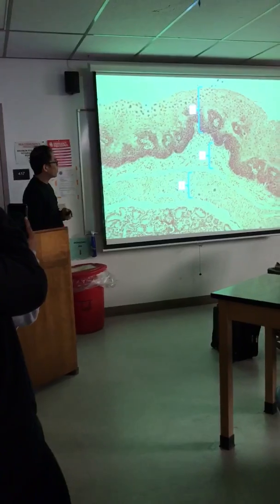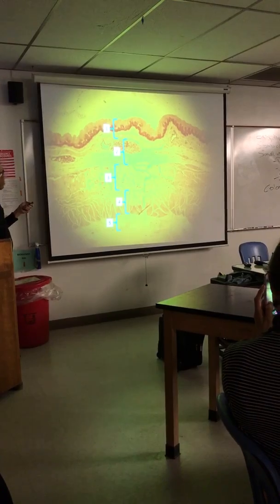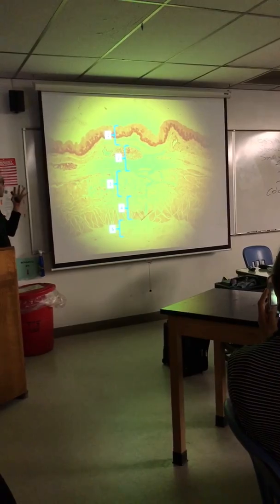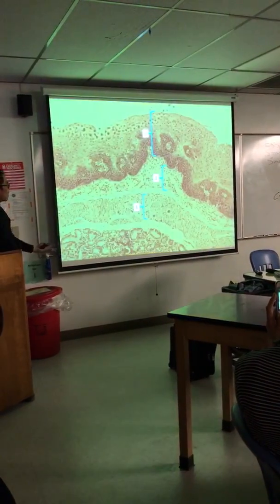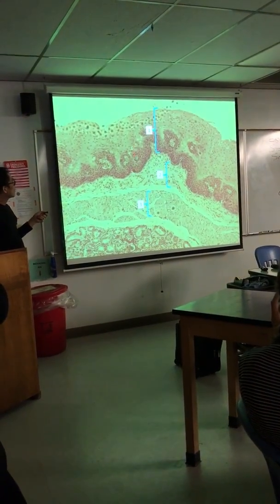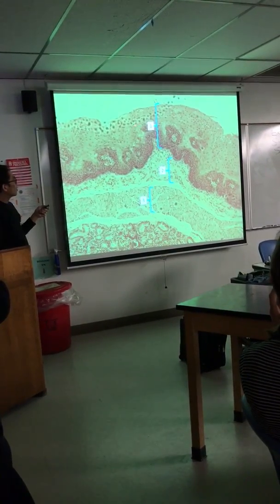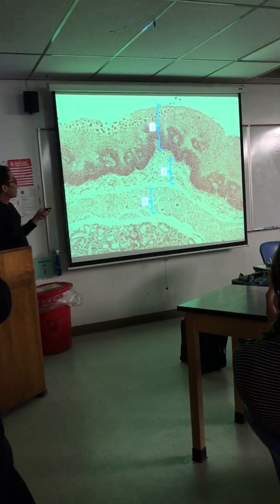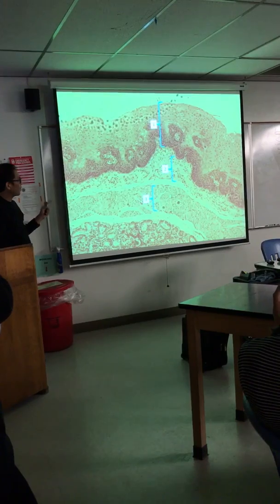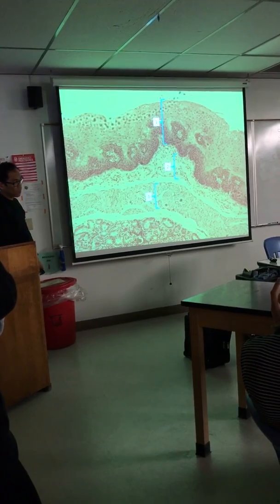Well, this is a close-up view of the top mucosa. So let's go low mag, see that? We're going to look at it close up, because you can see a lot of things well in the esophagus that you can't see well in other places. So first, know this is the esophagus. Here's the esophagus. 1, 2, and 3 are all mucosa. So this is called a stratified squamous epithelium. Remember, we only classify it based on the apical cells, which are flat and there are many layers. Stratified squamous epithelium for number 1. Number 2, lamina propria. Number 3, muscularis mucosa. Okay.